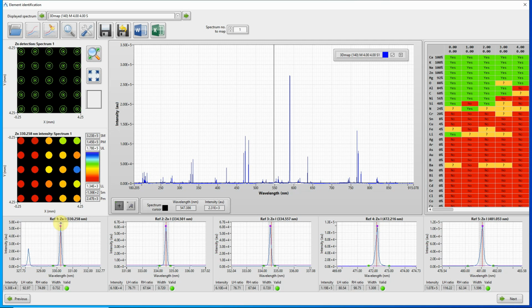The peak window parameter specifies the interval either side of the candidate peak in which it must be a maximum to be defined as a peak. This is to eliminate candidate peaks at the edge of the defined search region which are not true maxima. A purple dot is used to mark the location of the peak if one is found. See the purple dot there.